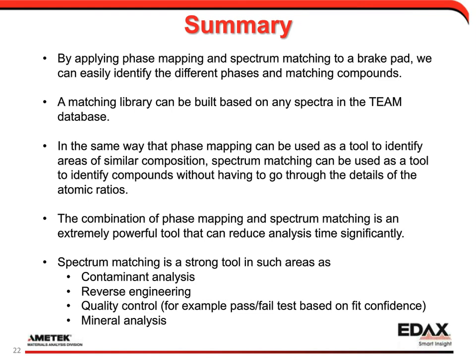In this case, you'll most likely do it on the quant numbers and not just on the spectrum match. Or we build a mineral library here. Mineral analysis is another of the big areas where we use spectrum matching.